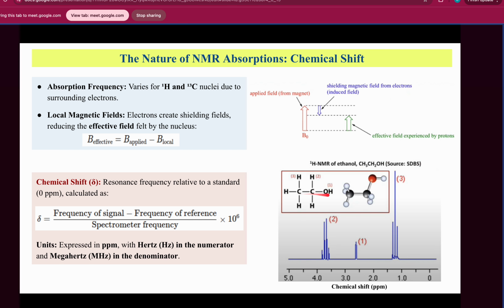So ultimately it has four different hydrogens attached on the adjacent atoms, so its subpeaks will be 4 plus 1, which will be 5. And similarly for this OH, because its adjacent carbon has two hydrogens, it will be 2 plus 1, equal to 3. So there will be 3 subpeaks which we will observe here.